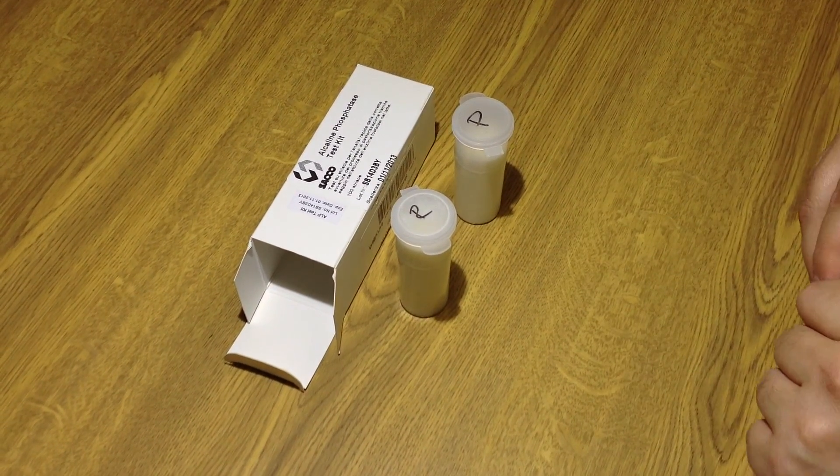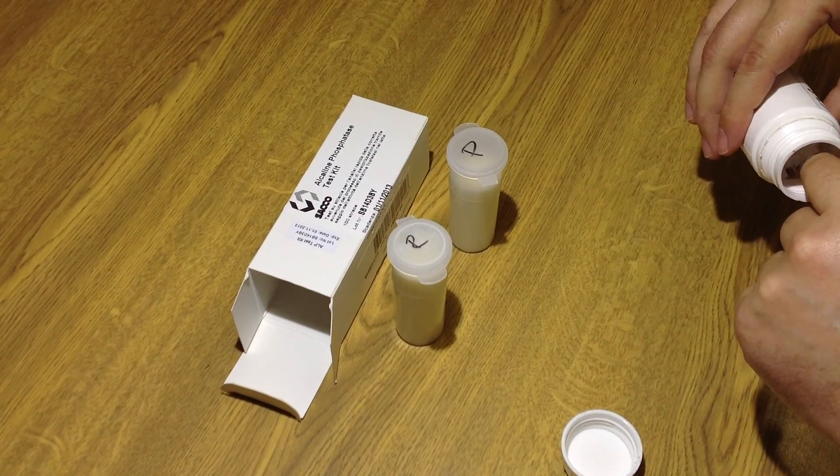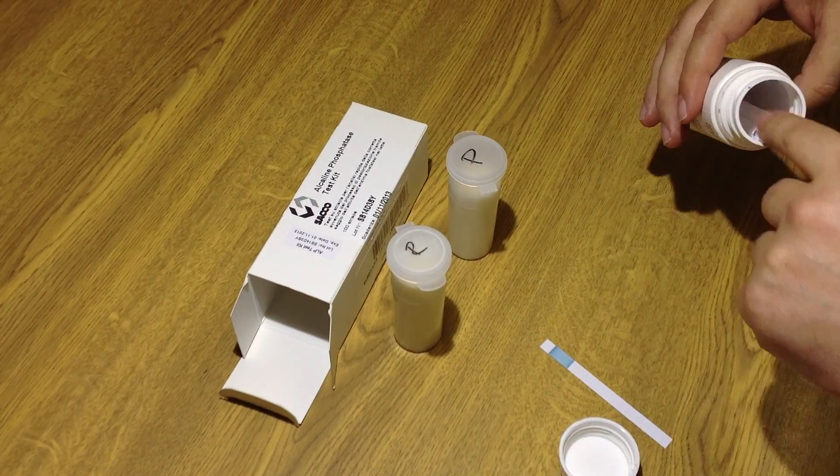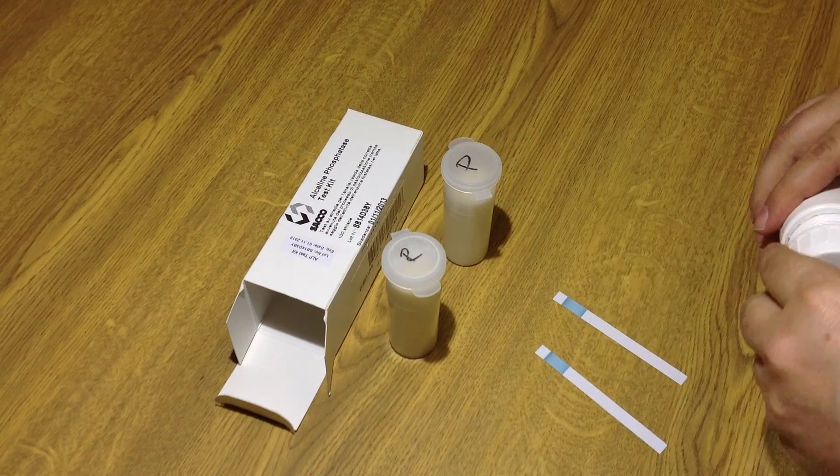Alright, we're doing an alkaline phosphatase test. Just want to get two strips out. I've got a raw milk sample and a pasteurized milk sample.